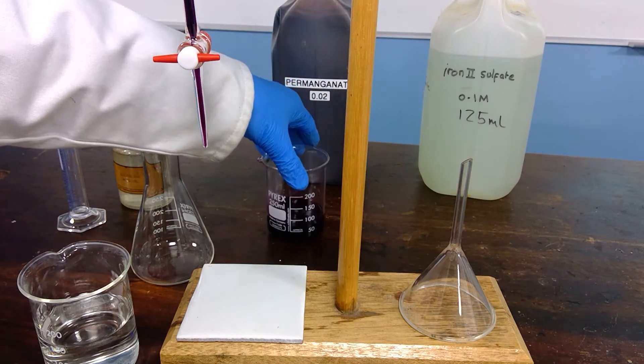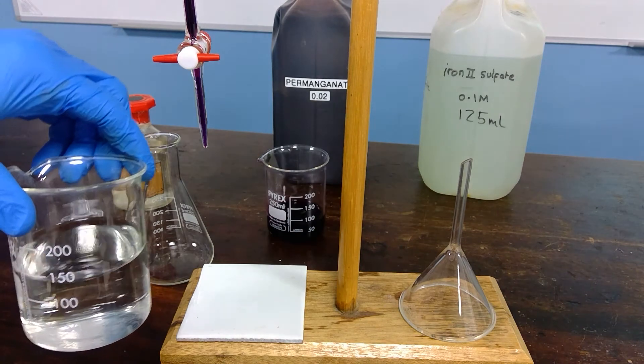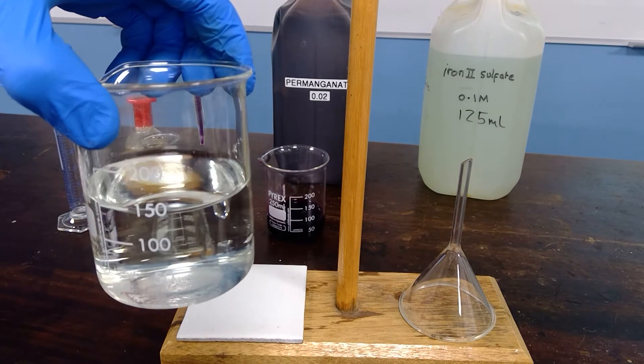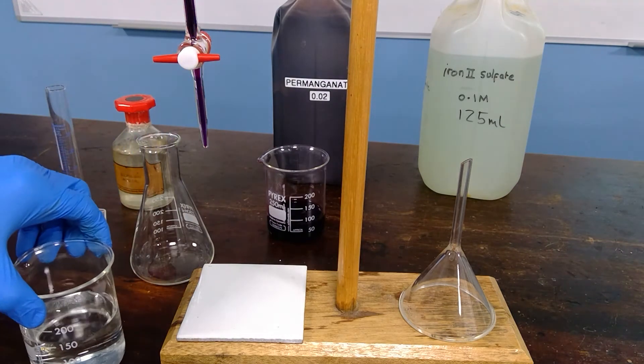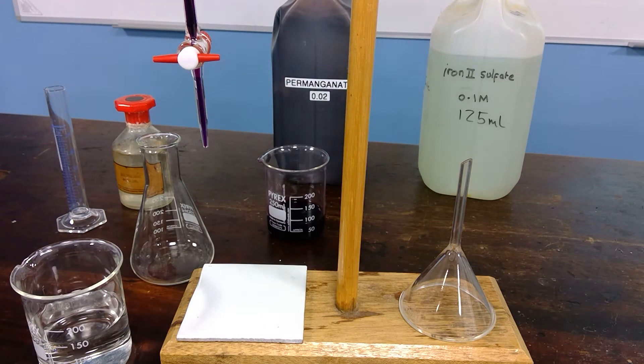We're going to titrate it against 25 cm³ of the iron(II) solution, which is actually a very pale green colour — a much less intense colour, as indeed is the product of the reaction. We need to acidify the solution to make sure that the purple manganate 7 is reduced to manganese(II) aqueous ion, which is virtually colourless. Therefore, the manganate 7 acts as its own indicator.